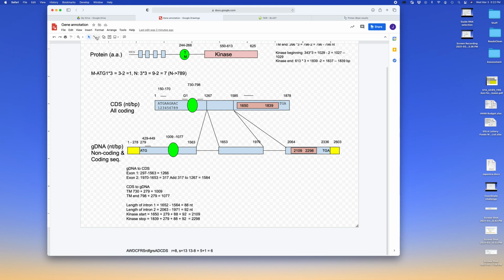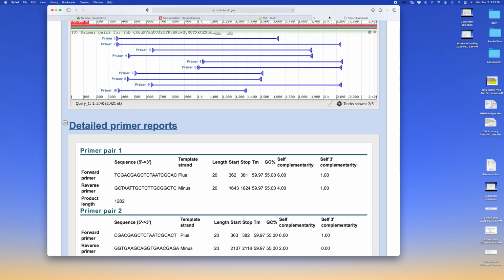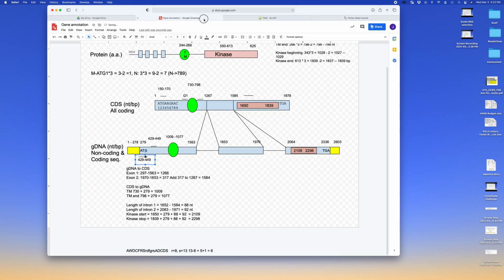All right, so let's draw here. We draw a line like that. We can put an arrow on it, make it look like a PCR primer, and then we can slide it like, let's put it down here. Okay, and so then we might need to move this over just a touch. My diagram's getting really messy. You can spend time and make yours very readable. Okay, so that's going to be that, and let's check it. 363 to 382. Okay, the forward one's done.